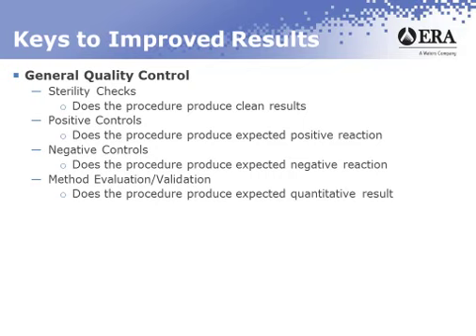at an appropriate level. So an appropriate level for wastewater type testing, at least when it comes to the PTs, is 20 to 2400. If you're challenging your method with basically a sample that is in the 10 to the 7th range, you're not really evaluating it at the level that would be appropriate for passing a PT.